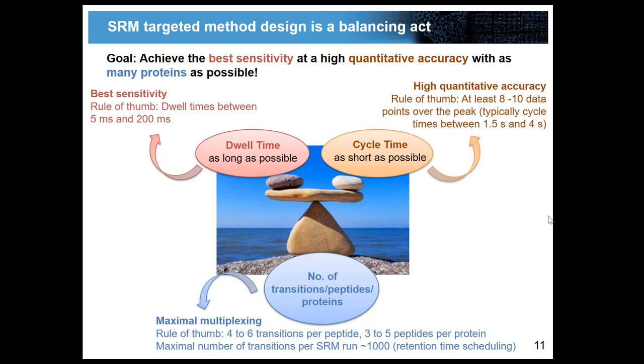So this will allow you to increase the number of transitions you're going after. But the downside is that if your retention time changes, you will lose a lot of information. So you might not even see anything. So there are advantages and disadvantages.